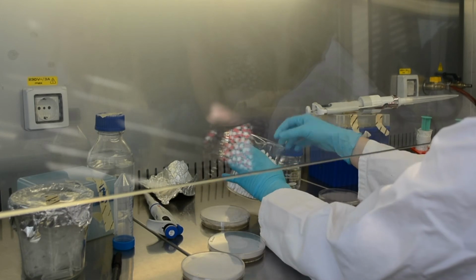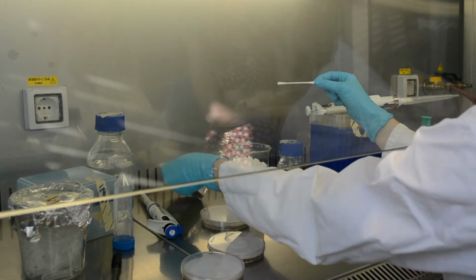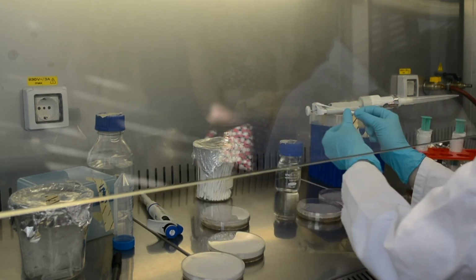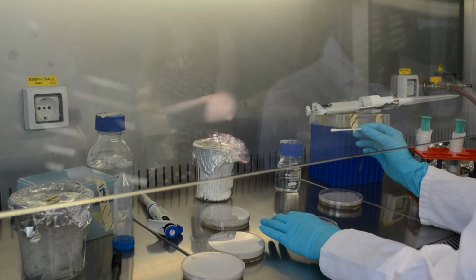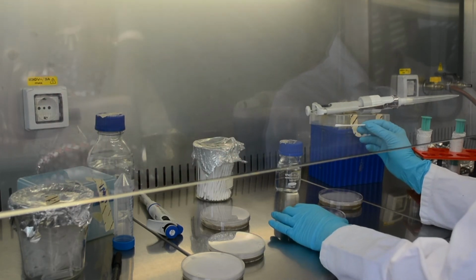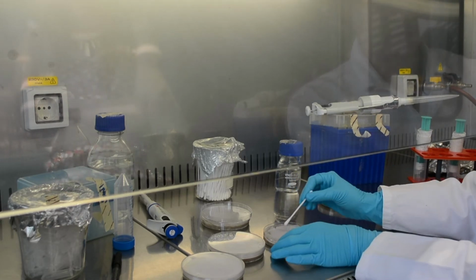To harvest the spores, use a sterile cotton swab and move over the plate. This will remove the spores, which results in a darker color of the water. Be careful and do not scratch away the whole layer of Streptomyces. The spores are on top and will be loosened with low pressure.